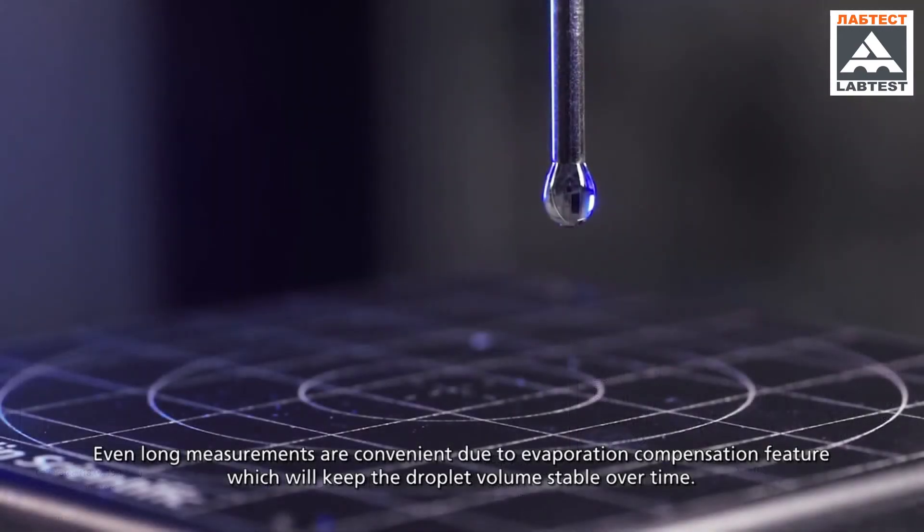Even long measurements are convenient due to evaporation compensation feature, which will keep the droplet volume stable over time.